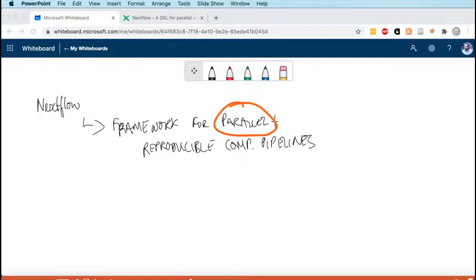You're slightly hostage to the quality of the documentation. The documentation for Nextflow is improving all of the time, but if you can't figure the documentation out to find out the things that you want to do, then it can be slightly problematic.